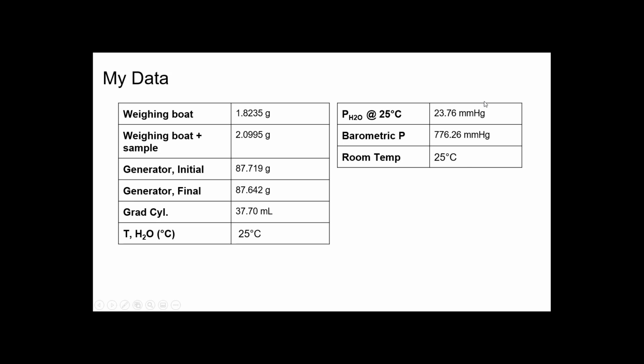So I already put that information here because in the back of the book is an appendix, and you'll look at the temperature of the water, and that's going to give you a value. But I've already pulled it out here, and this should give you something like that based on the temperature of the water. And then I'm saying that this is the atmospheric pressure right here.